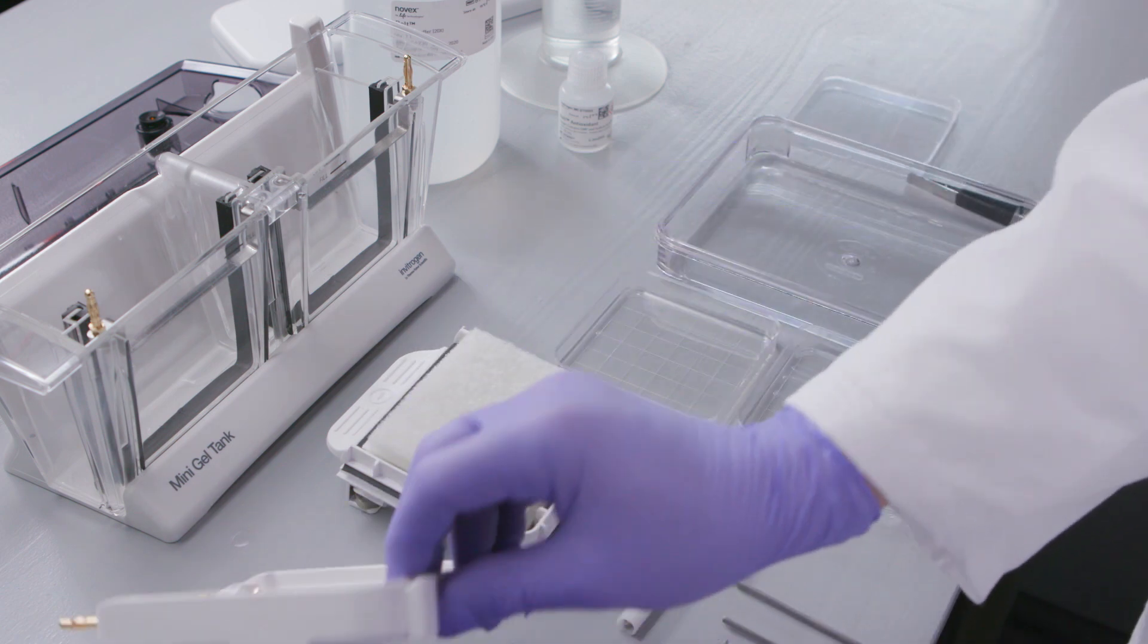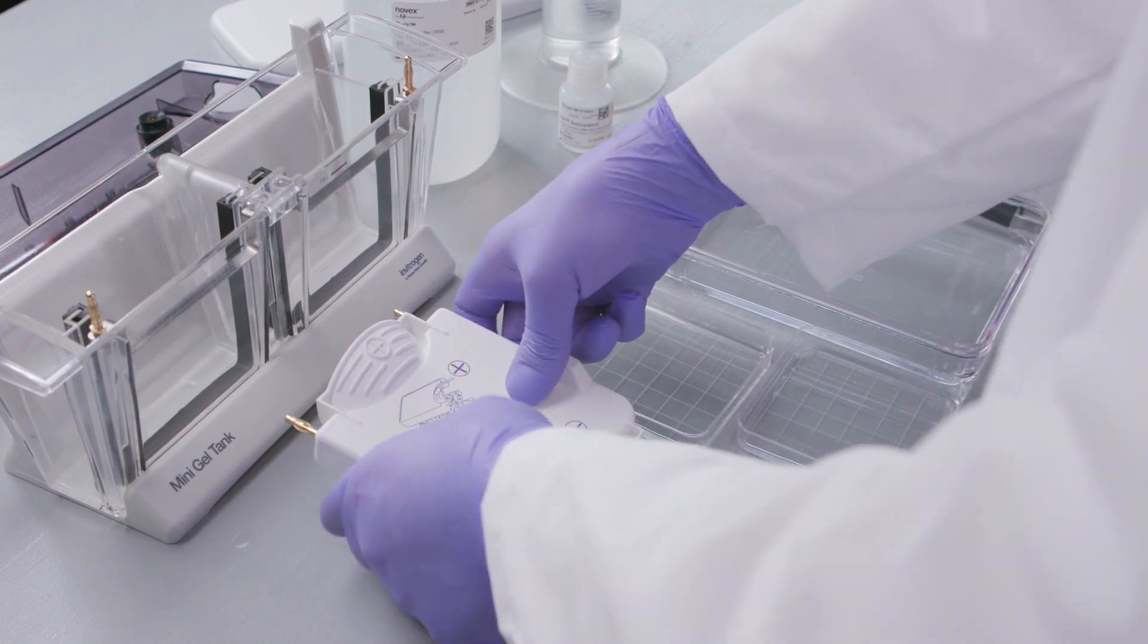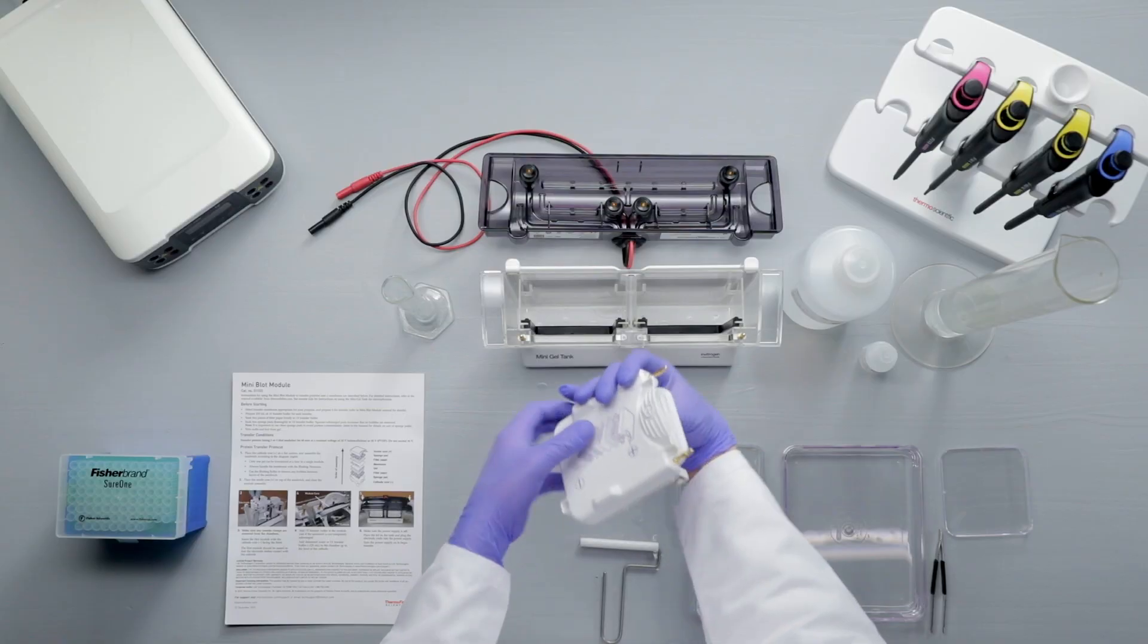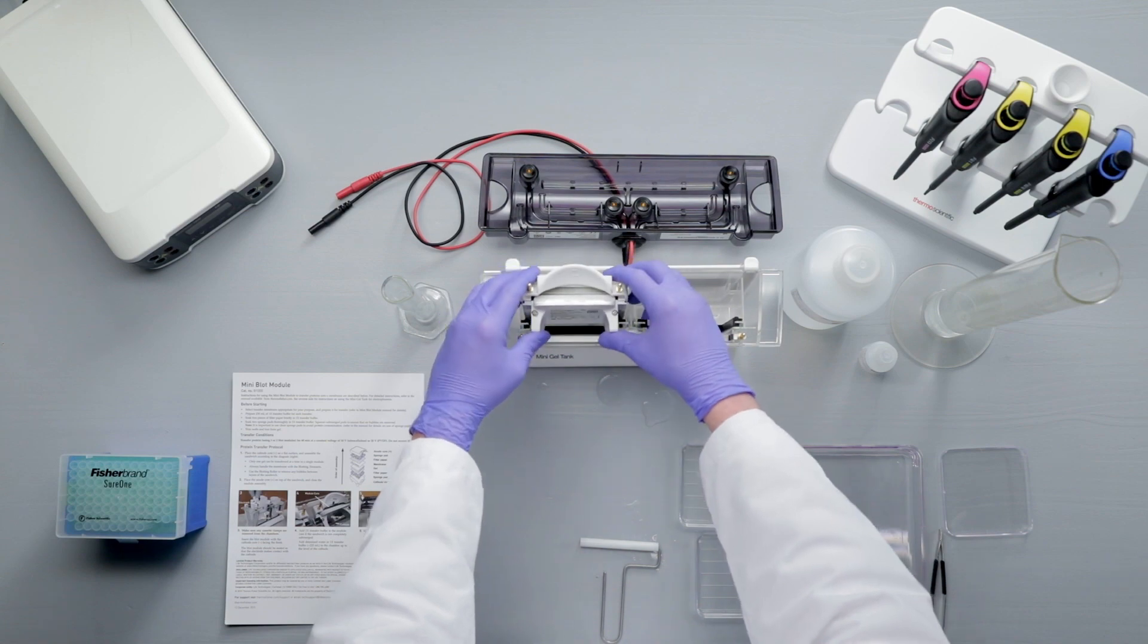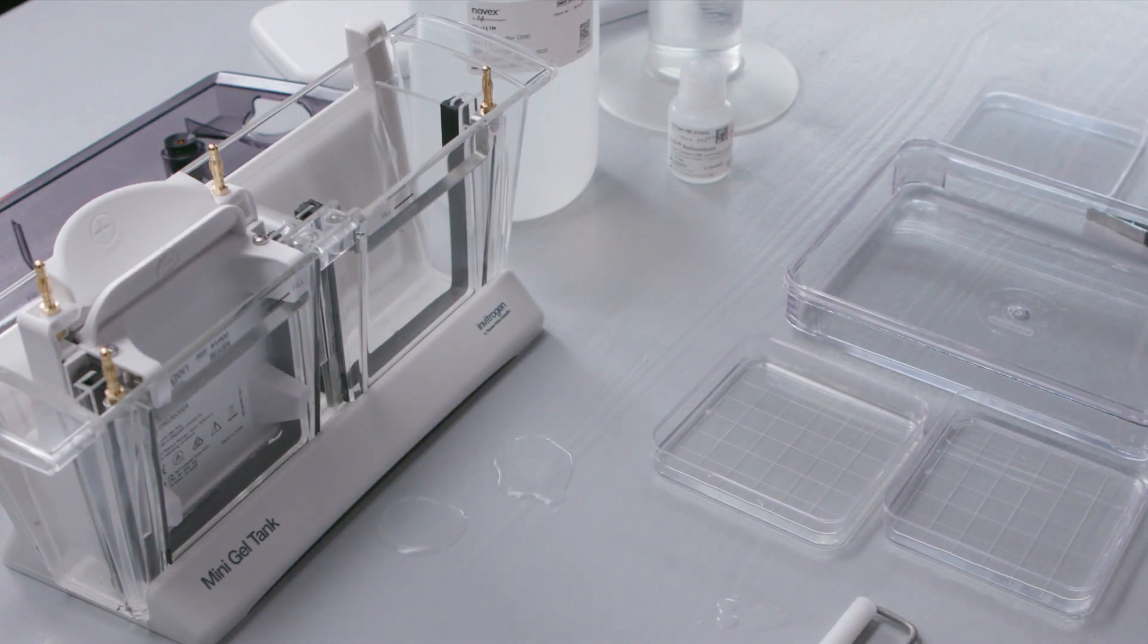Complete the assembly by placing the anode core on top of the sandwich and pressing the two module halves together. Insert the blot module into the mini gel tank with the cathode core facing front. The blot module should be seated with the electrodes contacting the electrode bar.